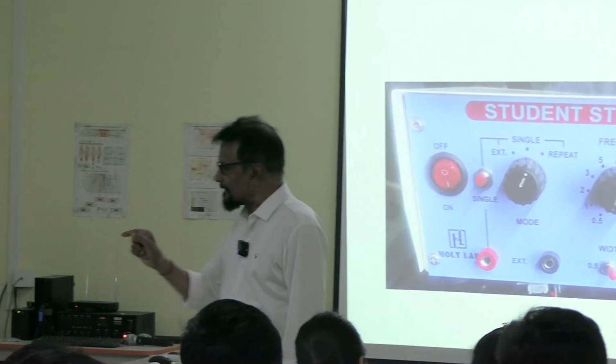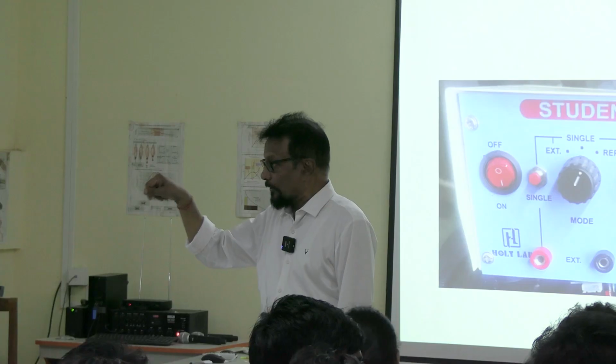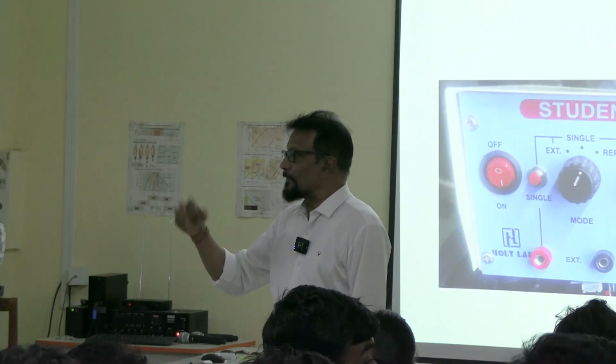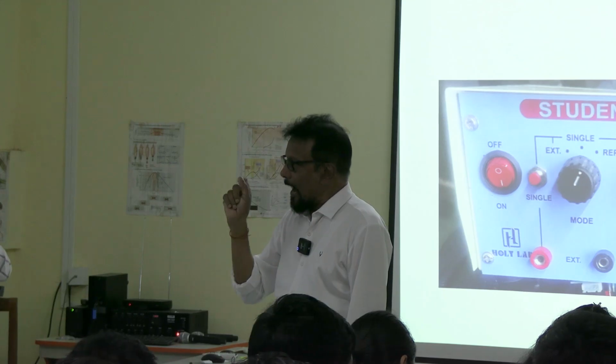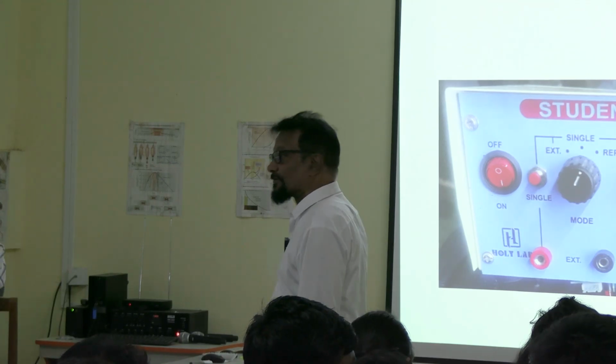And if you require only a single stimulus, that provision is there. Whenever the switch is turned on, it will produce a single stimulus in the output electrode, for a short duration and at your choice of intensity.